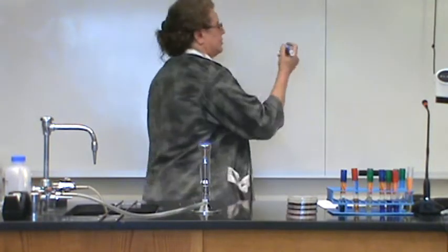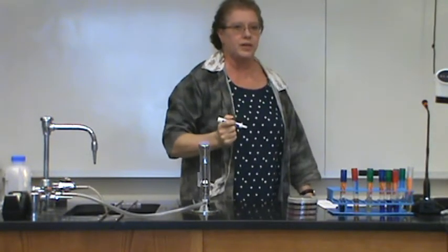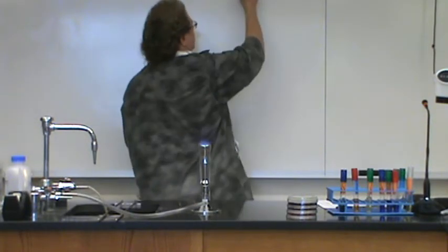Okay, so to clarify, SIM media used to determine whether a bacteria can produce hydrogen sulfide or not is inoculated using a stab technique.